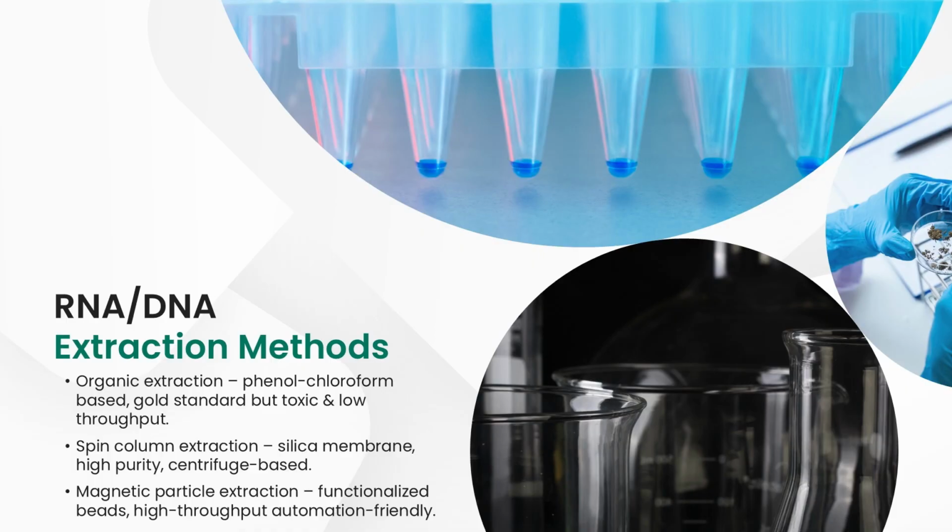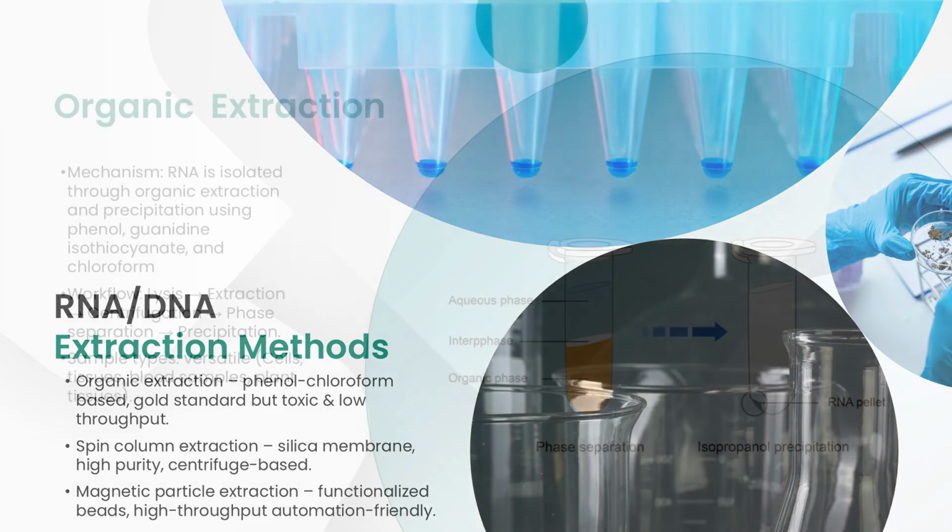Spin column extraction, which relies on silica membranes, is widely adopted for its balance of simplicity and purity. And finally, magnetic particle extraction, which has become increasingly popular for its high throughput and automation compatibility. Today, we'll focus mainly on spin column and magnetic particle methods. Let's begin with organic extraction.